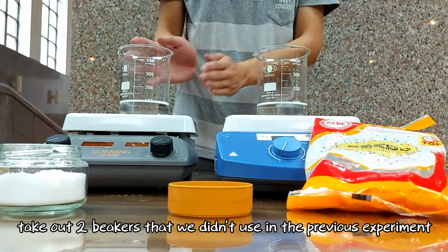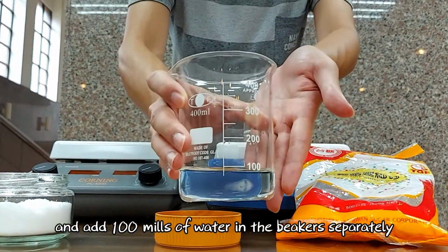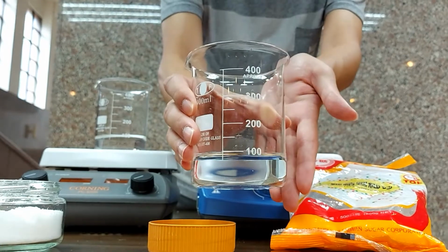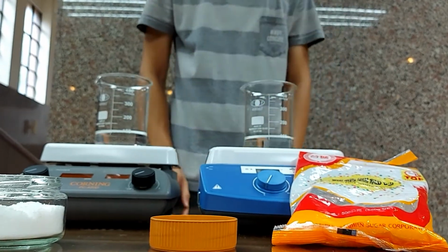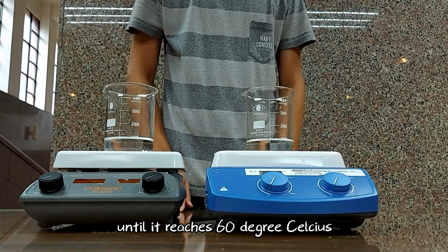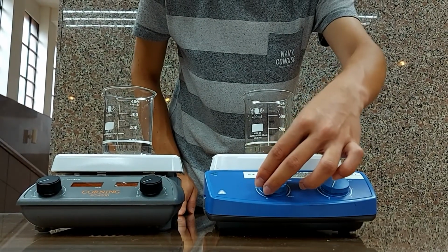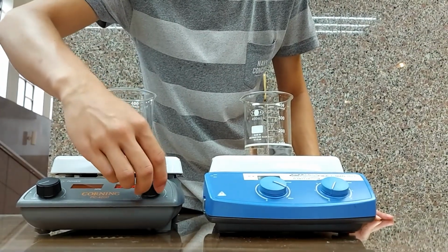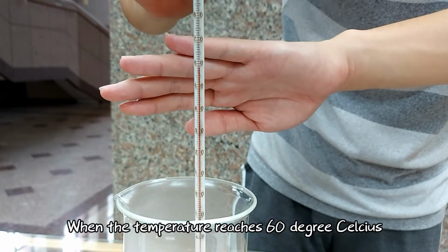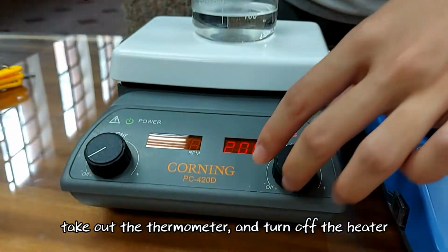Take out 2 beakers that we didn't use in the previous experiment and add 100 ml of water into the 2 beakers separately. And then turn on the heater carefully to heat the water until it reaches 60 degrees Celsius. When the temperature reaches 60 degrees Celsius, take out the thermometer and turn off the heater.